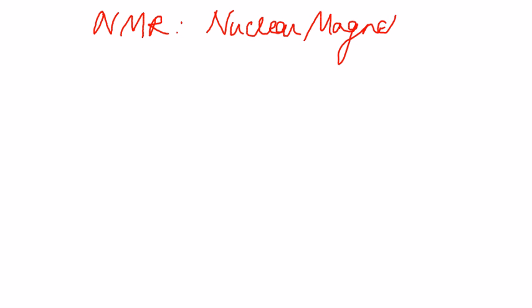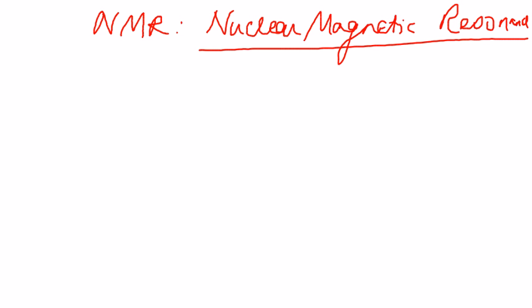This screencast is going to focus on NMR, which stands for Nuclear Magnetic Resonance. Nuclear magnetic resonance, or commonly abbreviated as NMR, is an extremely powerful tool that essentially gives you information about the entire framework of the carbon atoms.